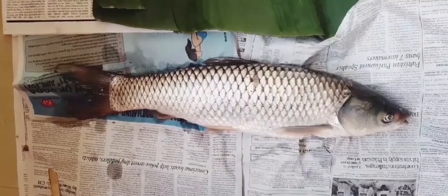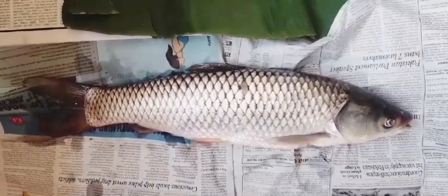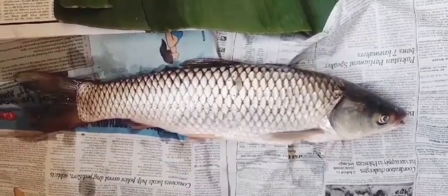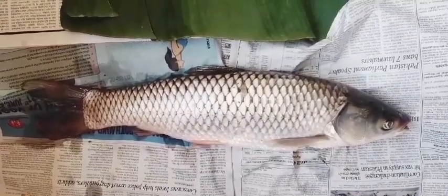Namaste, my name is Niti Sharma and today I am going to show you all the parts of the fish, both external and internal. The fish that I have taken is commonly known as grass carp.